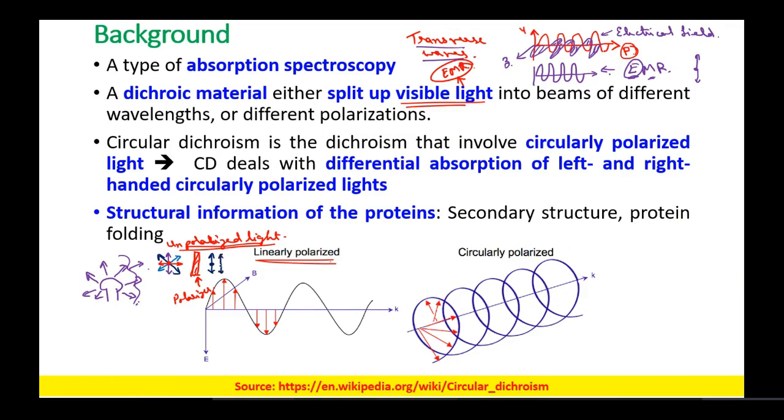So you will be getting light beams which have electrical modulations only in one direction. So what is happening over here? Initially we get the unpolarized light, where the electrical field of that light was in all directions. However, by employing this polarizer, we only allow the light that varies in one direction to pass through. Say, for example, in the y direction, the electrical field is being varied.